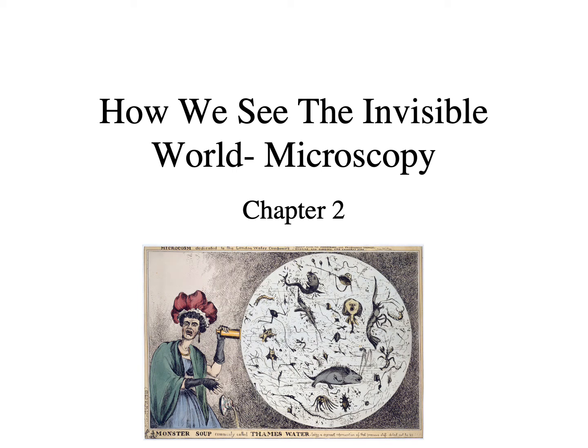All right, let's start chapter 2, which is about microscopy. In this chapter, we're going to talk about the terms associated with microscopy, different types of microscopes, and how we prepare specimens for microscopy.